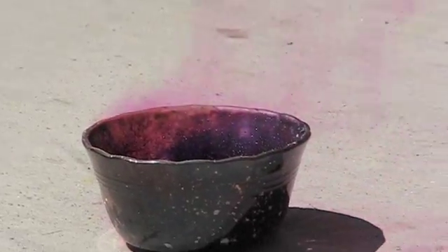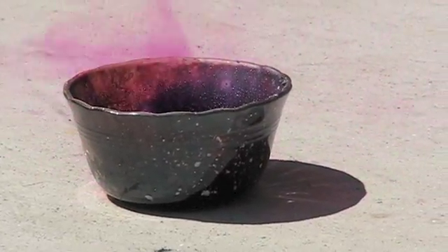The heat from the reaction has cracked the Pyrex that I contained it in.